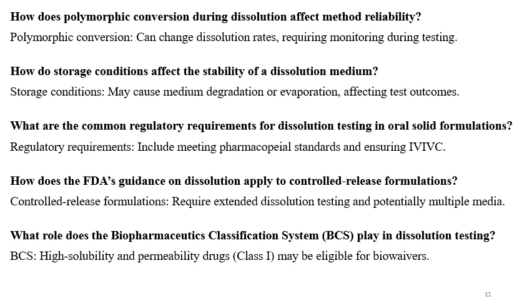What are the common regulatory requirements for dissolution testing in oral formulations? These include meeting pharmacopoeial standards and ensuring IVIVC. Also, the discriminatory power is required to be proved. How does the FDA guidance on dissolution apply to controlled release formulations? It requires extended dissolution testing and potentially in multiple media, which is known as multimedia testing.